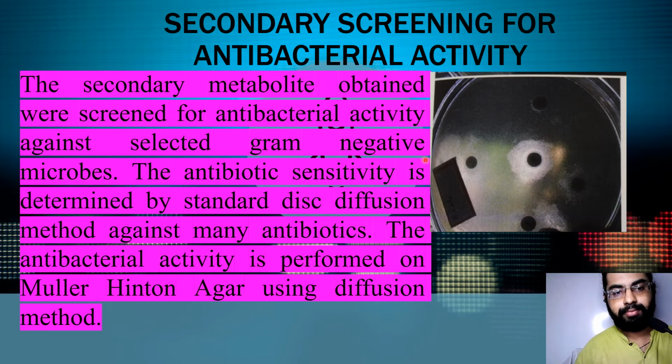This is a Mueller-Hinton agar and these are discs. So this method is called the disk diffusion method. Different gram-negative bacteria are plated on this Mueller-Hinton agar to check the antibacterial activity of the secondary metabolite that is produced from the isolate.